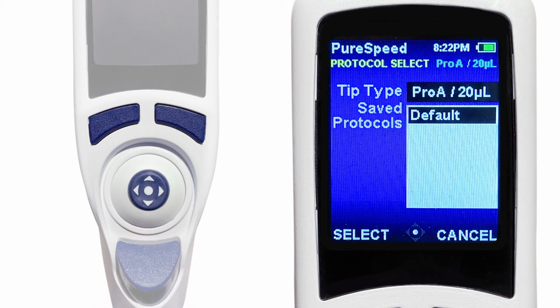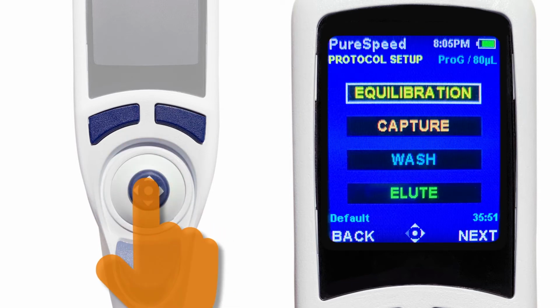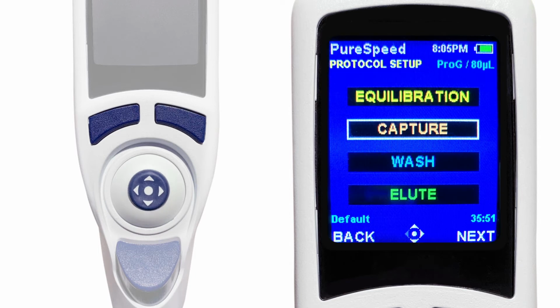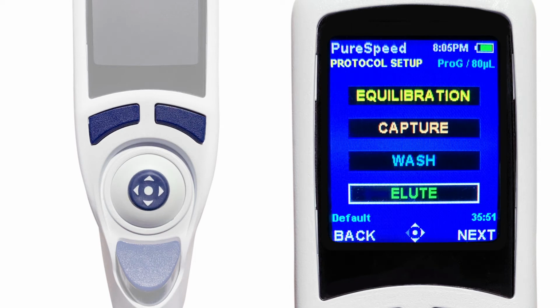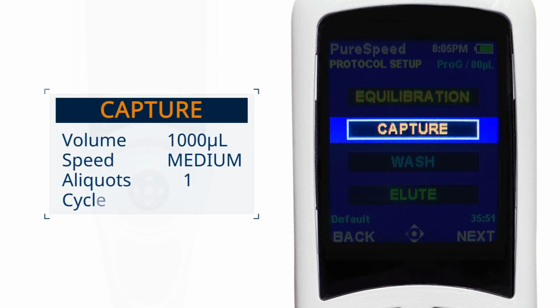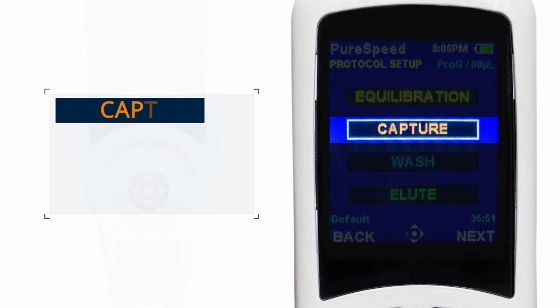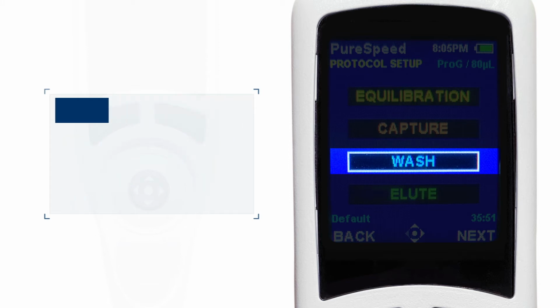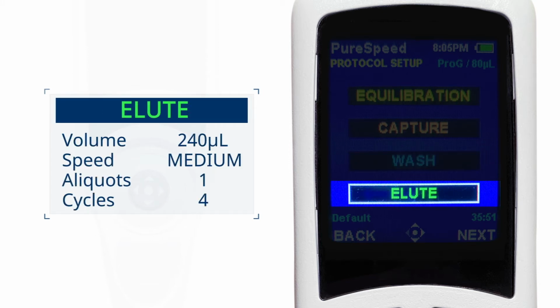Then use the joystick up and down controls to select the pre-programmed protocol for that resin. Your selection would be highlighted in white. Press down on the joystick to select the pre-programmed protocol. You will now see 4 sections which make up a method: equilibration, capture, wash, and elute. Each of those sections are already programmed to give you the best results for your selected PhyTip column. The included methods set the volume, flow rate, and the number of cycles for the pipette to intake and expel the sample through the column. In addition, they can be adjusted to customize your prep even more.